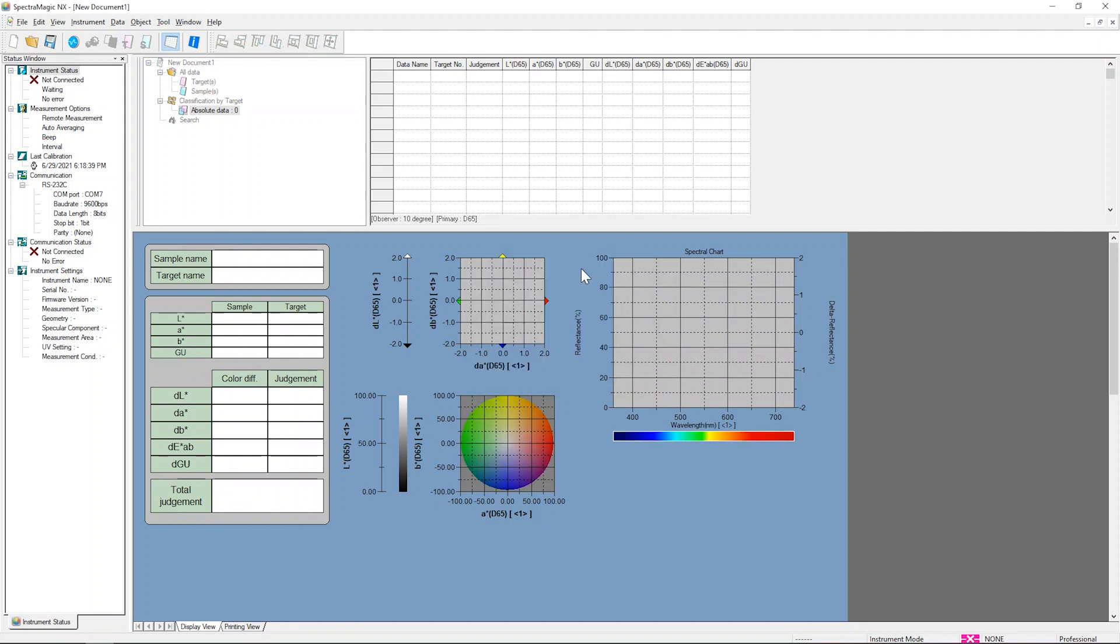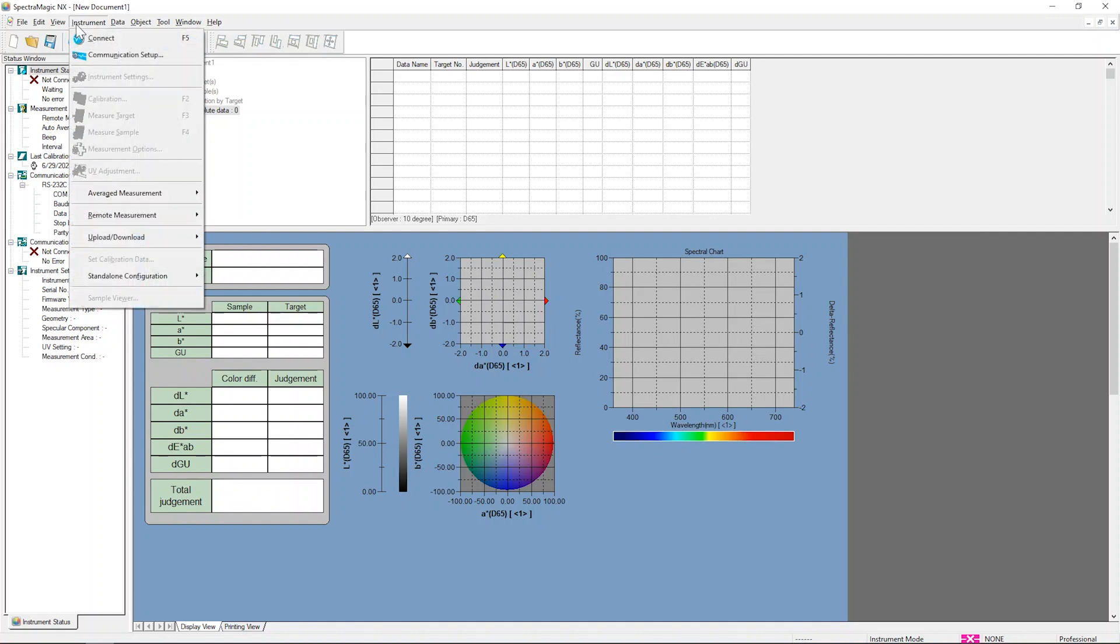After this initial setup, you can connect by simply clicking the Connect button, using the F5 key on the keyboard, or selecting Connect from the Instrument drop-down menu.